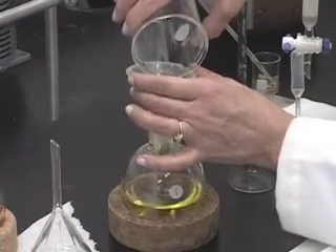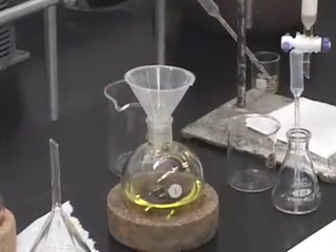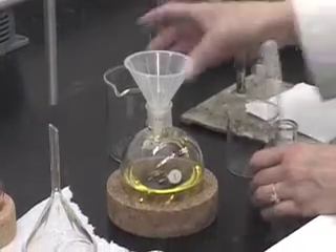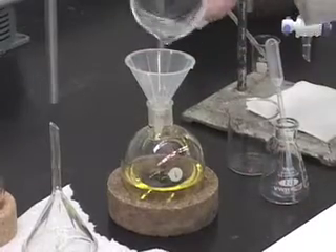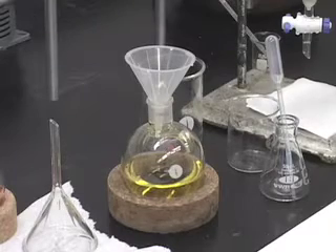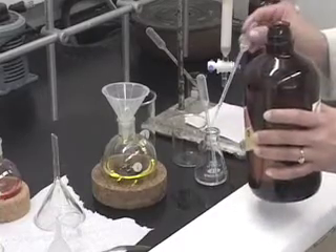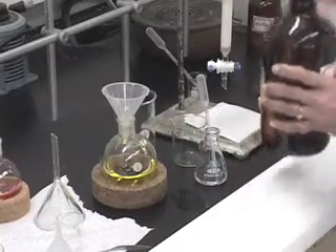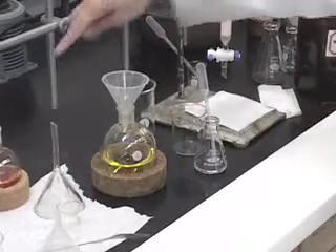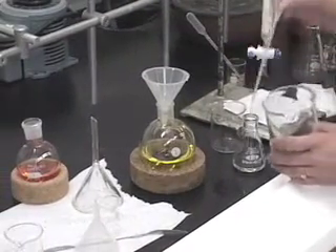Remember that we have pre-weighed these empty flasks. I am rinsing the beaker — you can rinse it a couple of times. To rinse the first fraction, you can use any of the solvents. For the second one, however, you want to make sure you are using one of the more polar solvent mixtures, either one to ten or one to one hexane ethyl acetate, because we know that the more polar component does not completely dissolve in hexane.